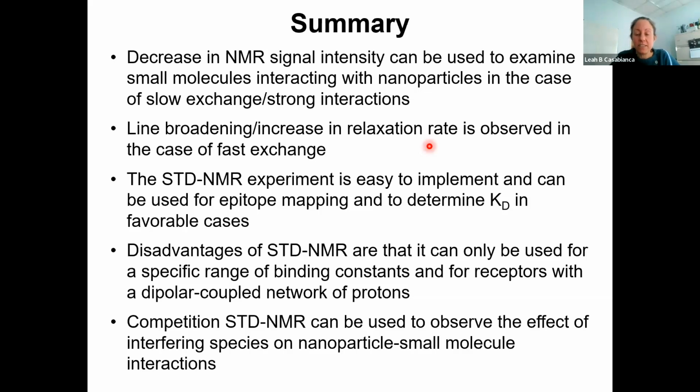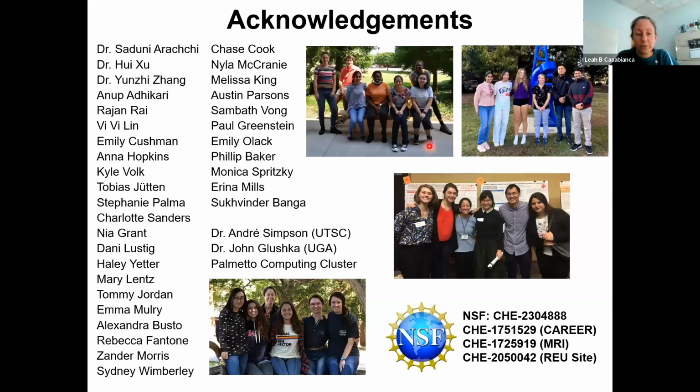And then last, competition STD NMR can be used to observe the effect of interfering species or additional species on nanoparticle small molecule interactions. So with that, I would like to thank the members of my group, collaborators, and also the NSF for funding, and thank you for your attention.